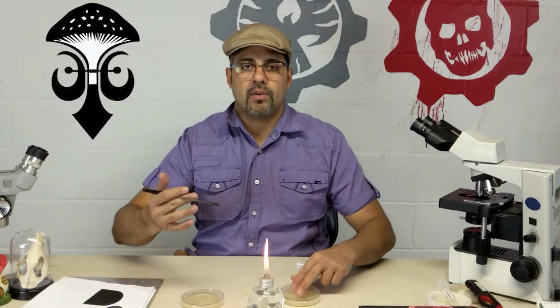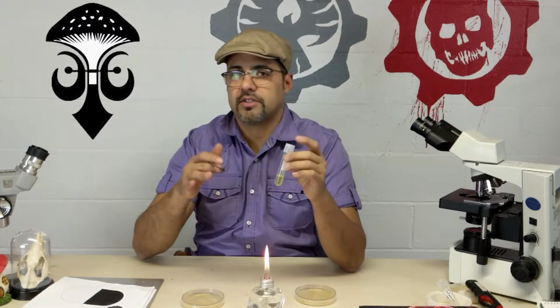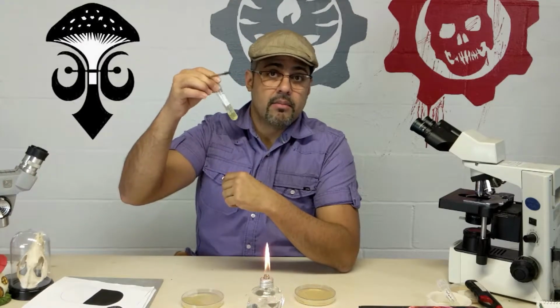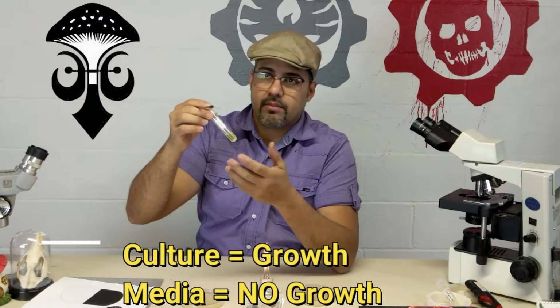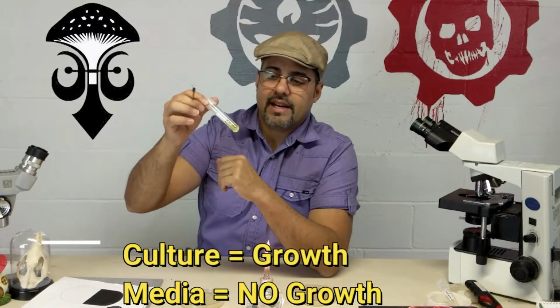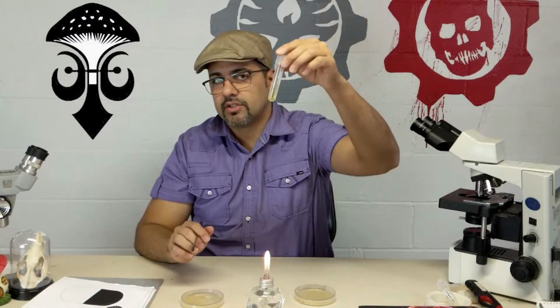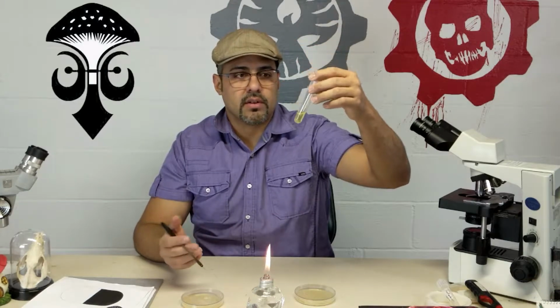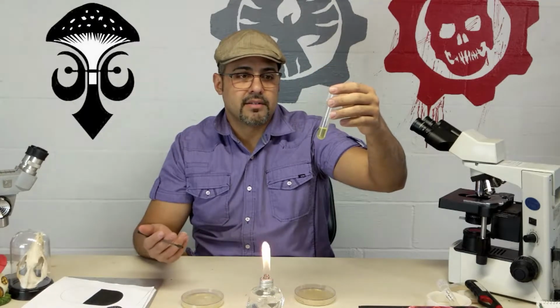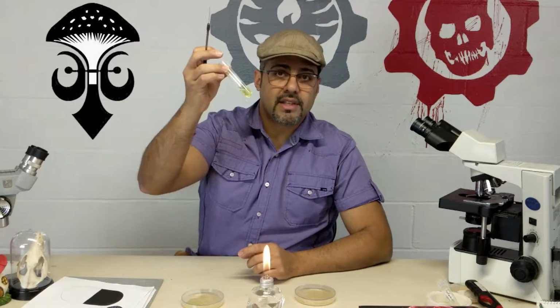All right, so let's see how it is. Imagine this is a culture, and why I'm calling it a culture versus a broth. You should know by now that a culture is when you have a tube with broth, or nutrient broth, can be whatever that has nutrients, and the actual microorganism is growing in here. That's why we call it a culture. If it's sterile, like this one, there's nothing growing in there, it's just called a media, right? Media tube with just medium, okay? Now, let's imagine that this is a culture.